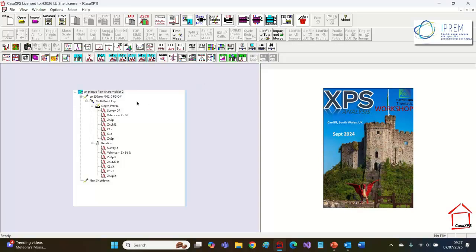In this video I'm going to illustrate how to convert experiments that were measured using the Avantage data system using the .dth filter. The reason I'm introducing the .th filters is because these are more recent filters that have been added to CasaXPS than the older ones, which are .vg type filters, so .avg, .dvg. These are older than the .dth filters, and these newer filters will allow you to convert the more intricate experiments that are performed on the Avantage system.